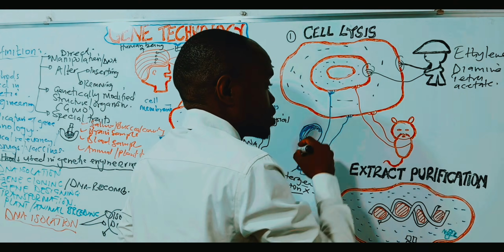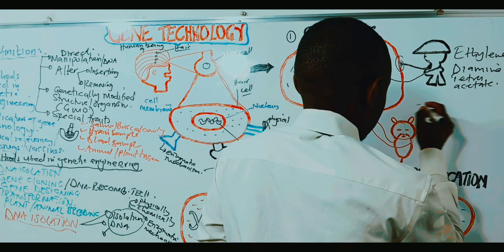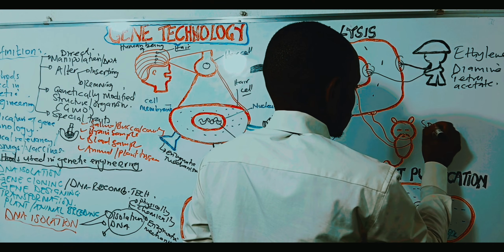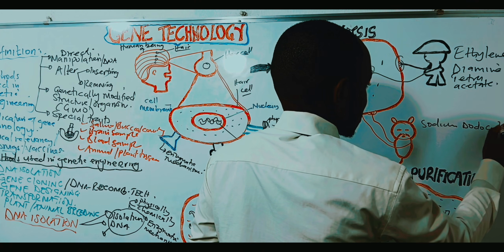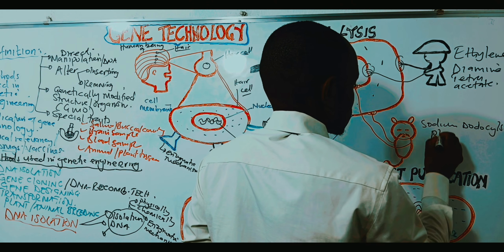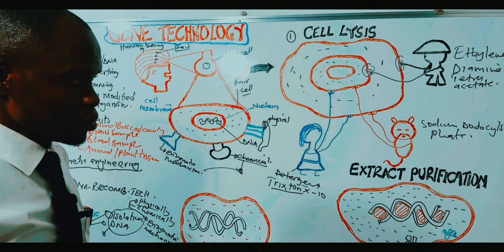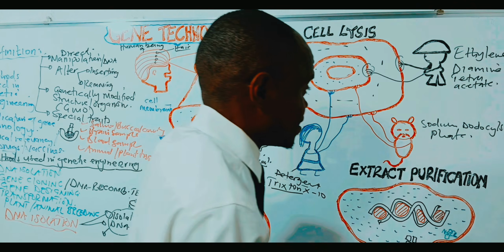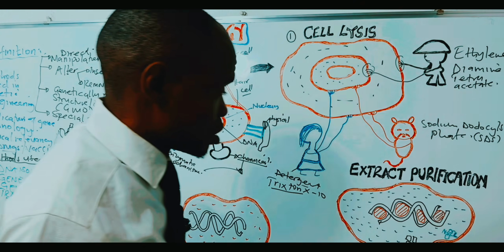You get? They also have another component, members. It is called sodium dodecyl sulfate, which we normally call SDS.